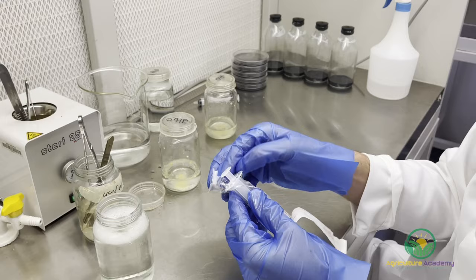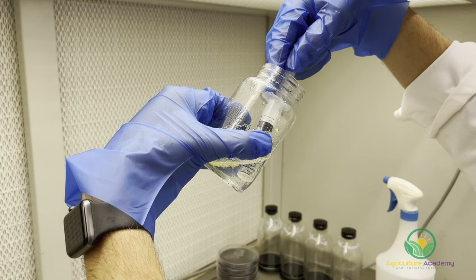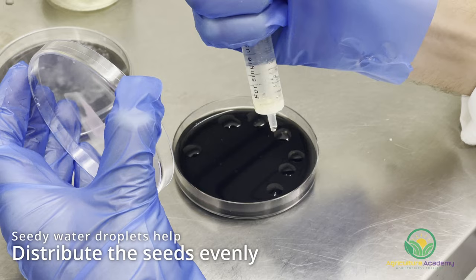Using new, sterile syringes, the seeds were sucked up and dropped onto the solidified medium. As you can see, this helps to disperse the seed more evenly over the medium and will allow them to grow bigger while still in this same petri dish.